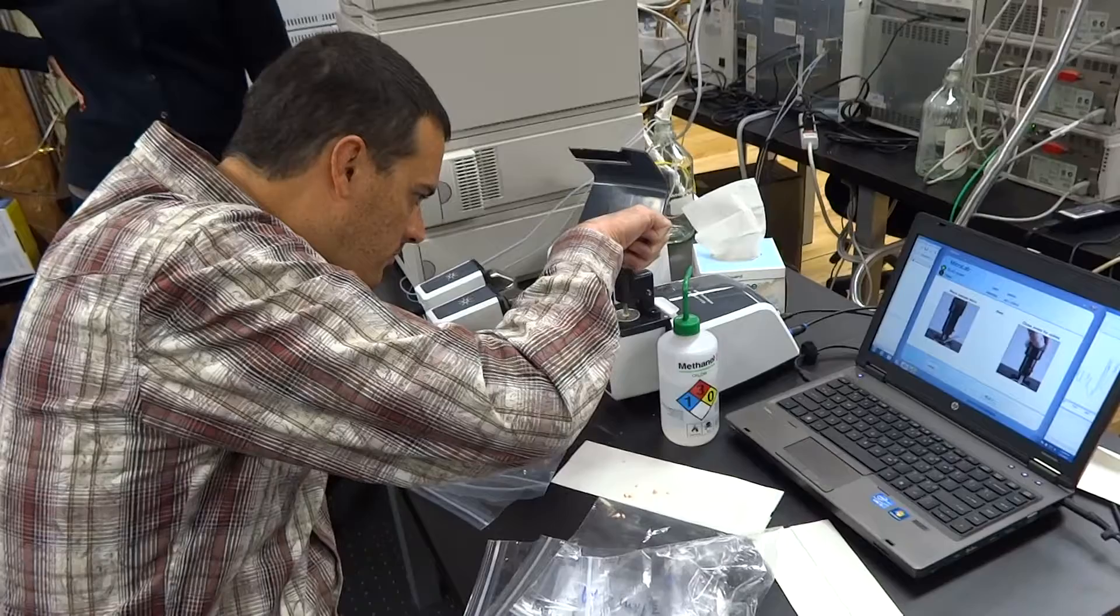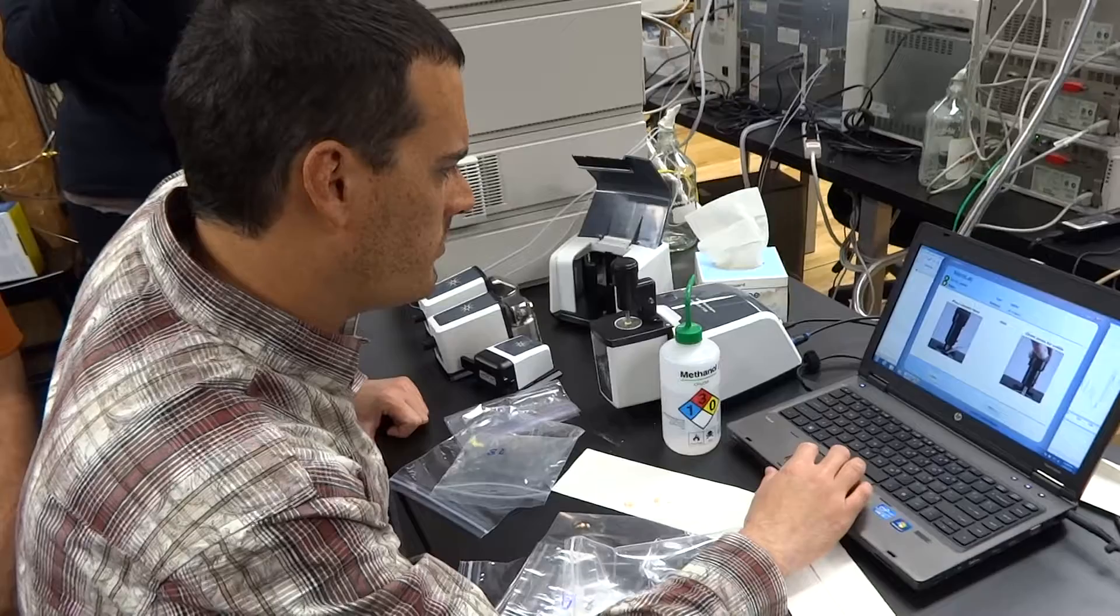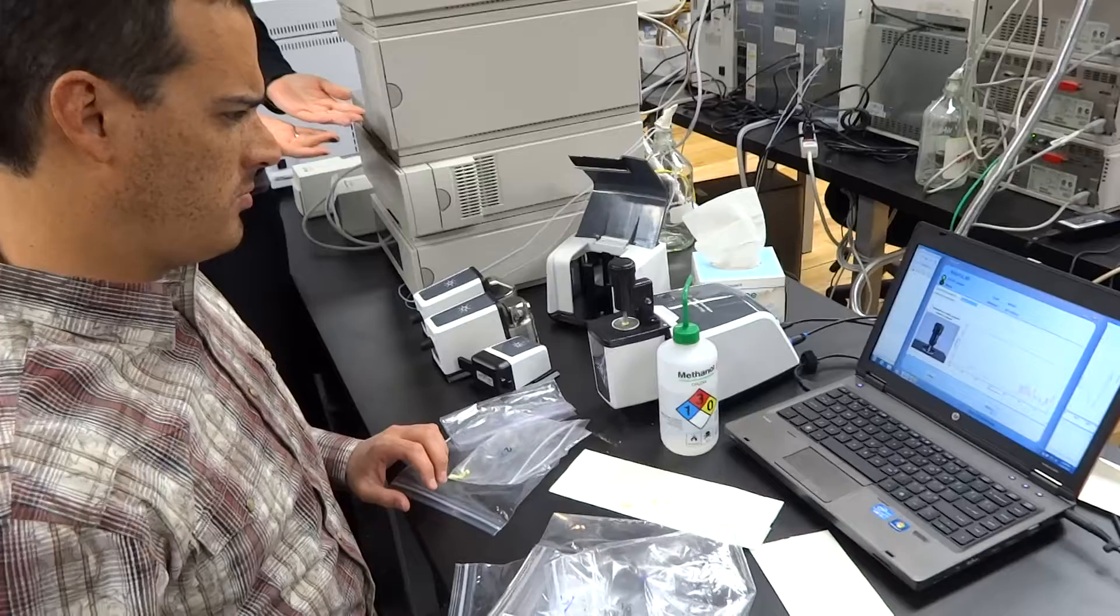It has some features. Like the interferometer came from our Agilent handheld FTIR technology systems. So honestly, we can pick it up now and run a sample holding it in our hands. I don't think a Bruker can do it.